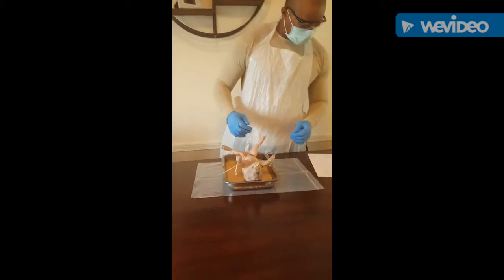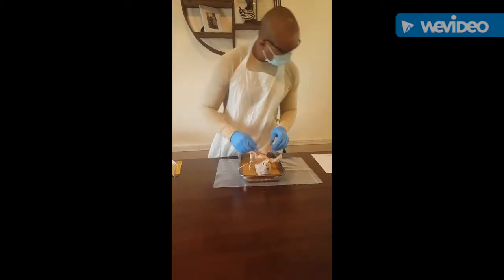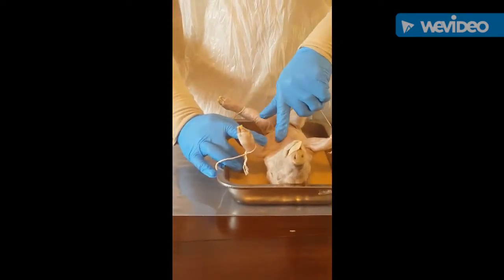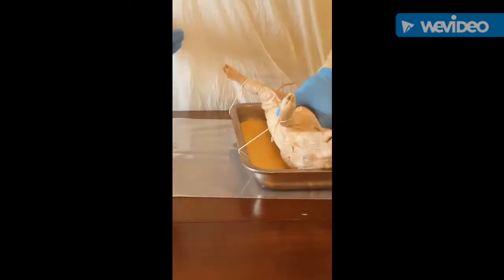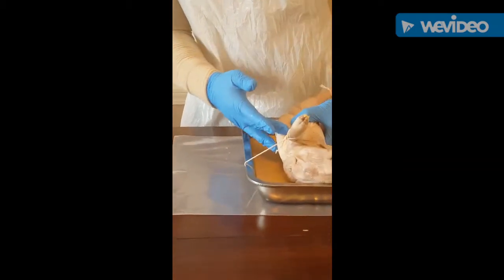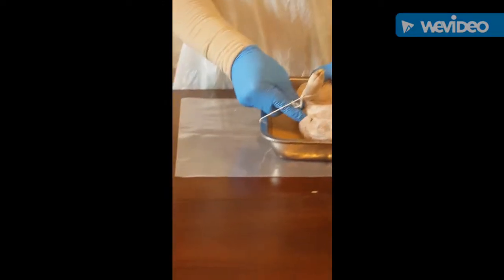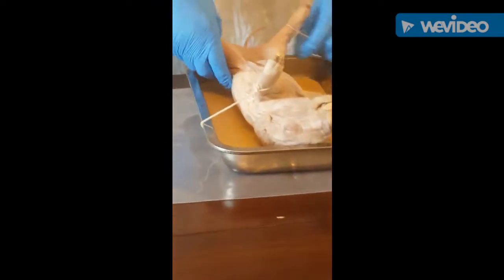So moving on to the muscles of the fetal pig. All right, we have the pectoralis major, which is kind of like the pectorals. It's fan-like and comes over the top of the thoracic cage, so it's right here from the shoulder over. The latissimus dorsi, which we call the lats when we work out, is going to be from this area here up to the muscle that's right here. We have the deltoids, where the shoulder meets. We have the rectus abdominis.